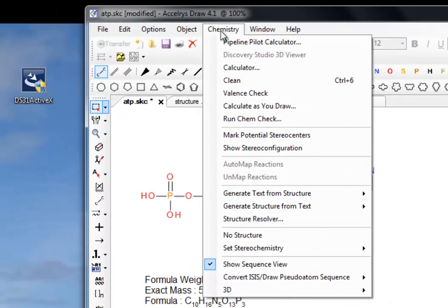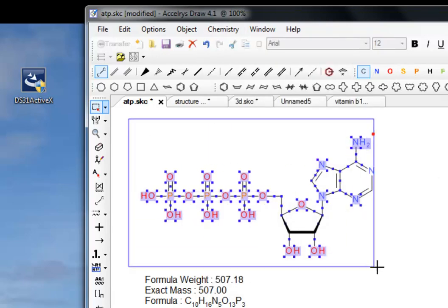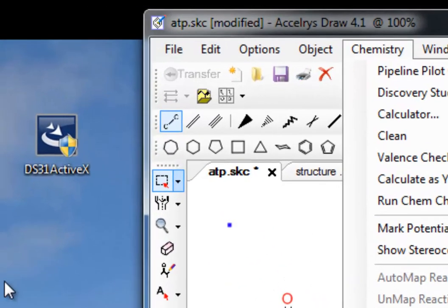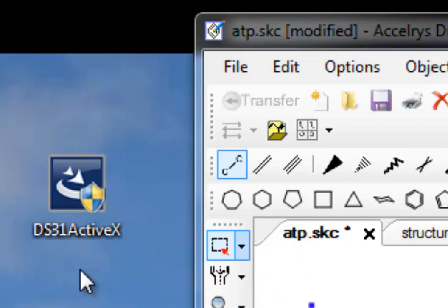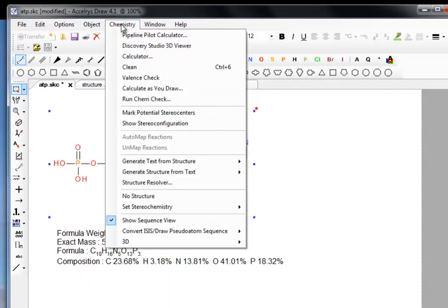If you go to Chemistry, at the moment you'll see there's an option grayed out called Discovery Studio 3D Viewer. If we select ATP again, we'll find it's now not grayed out. I've already installed the control here, so when I click on it, what will happen is when you install it you'll be directed to a website and it'll give you the opportunity of downloading this ActiveX control. In this case I downloaded it to the desktop and just clicked on it, and it installed itself in AccelerusDraw.